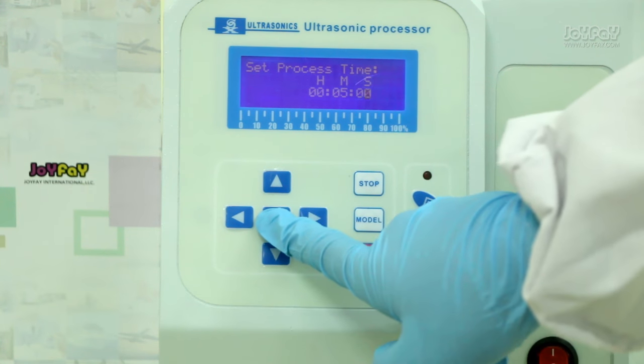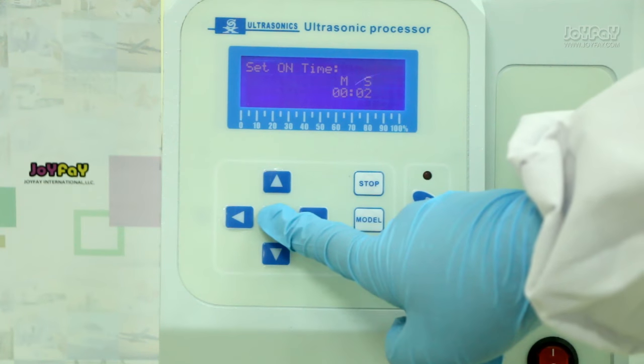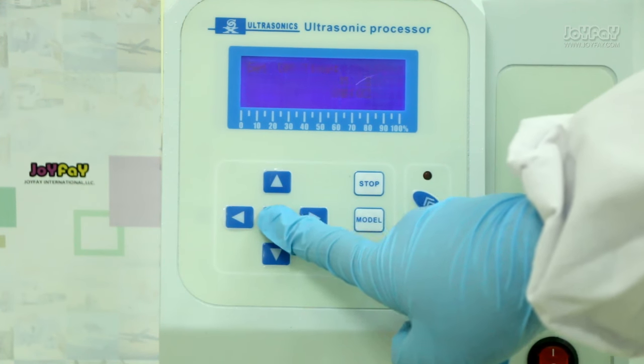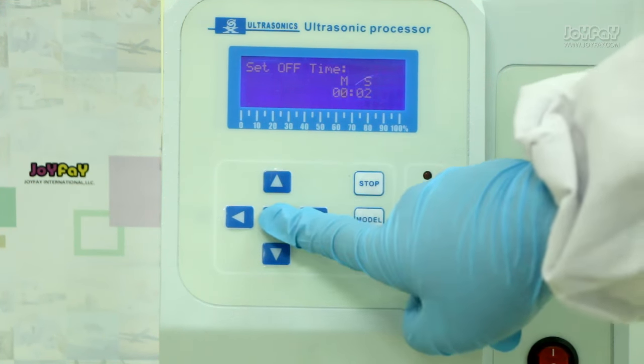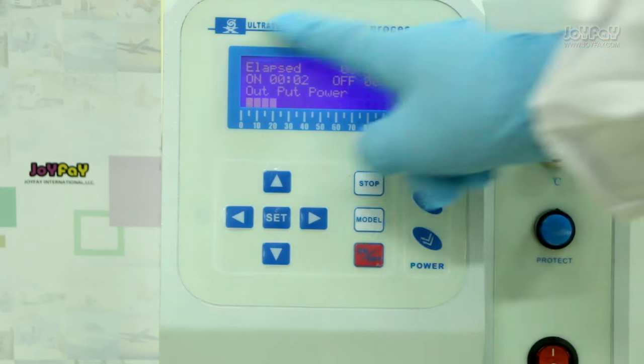Press the set button and we will move to set the on time. Press the set button again and we will move to set the off time. Press set once more and we have finished setting the processing time.